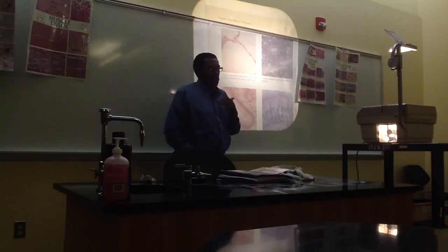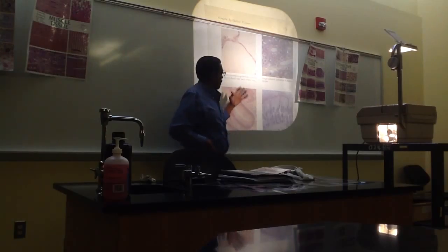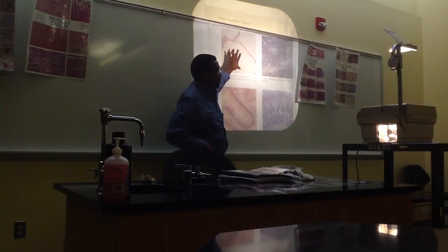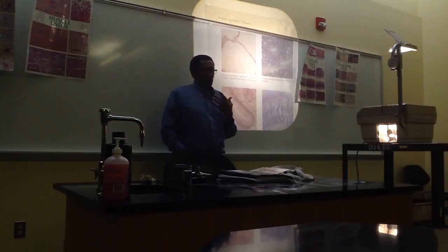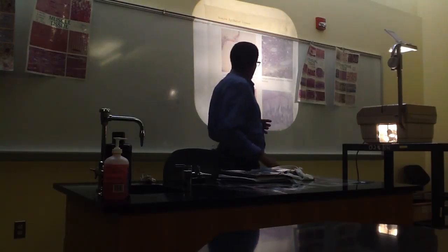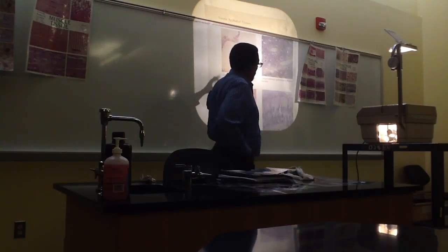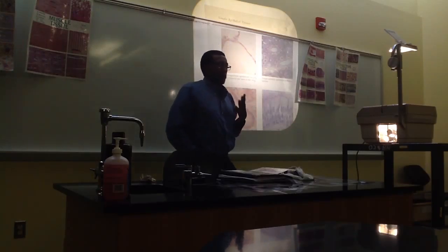If you did a cheek smear, where you take a blunt toothpick, scrape the inside of your jaw, and then spread that onto a slide, stain it, and look at it under the scope, then you would see separate flattened cells, because you're really scraping off the top layer of flat cells. But you won't have to identify simple squamous.